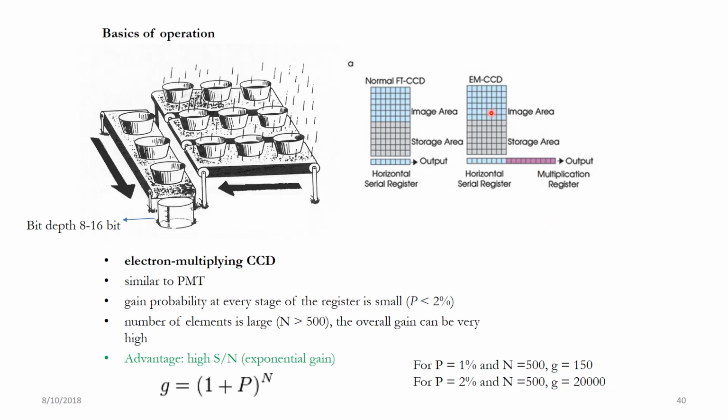Sounds cool, right? Because of such a low noise and such a high efficiency, it can measure even single photons, and that's why they are used in single molecule imaging.